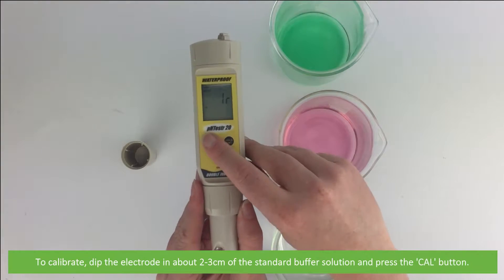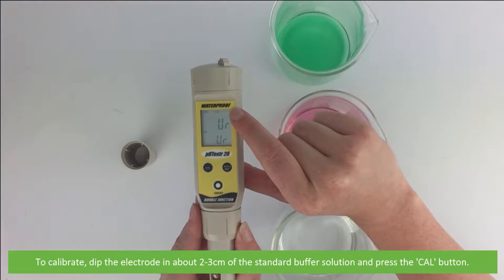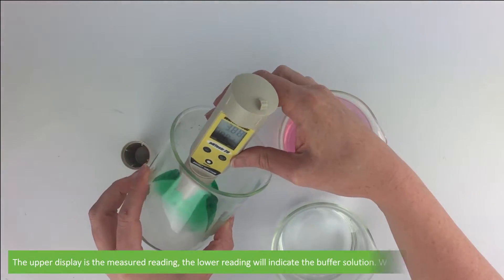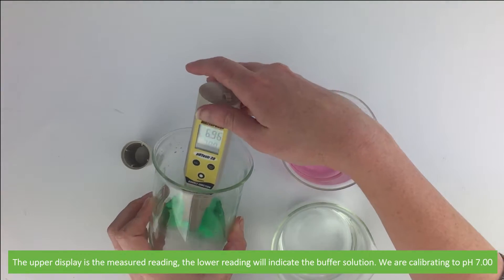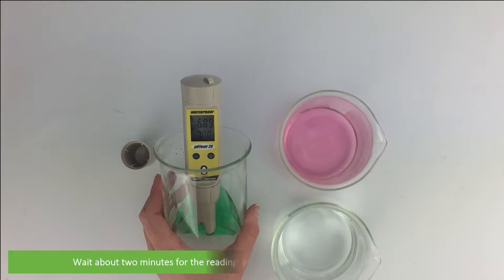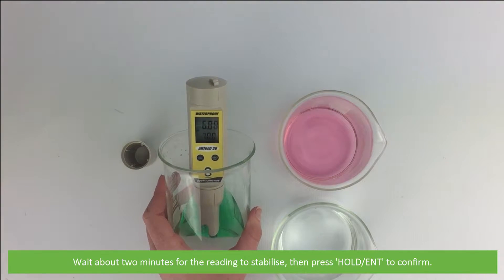To calibrate, dip the electrode in about two to three centimeters of the standard buffer solution and press the Cal button. The upper display is the measured reading and the lower reading will indicate the buffer solution. Here we are calibrating to pH 7. Wait about two minutes for the reading to stabilize, then press Hold/ENT to confirm.